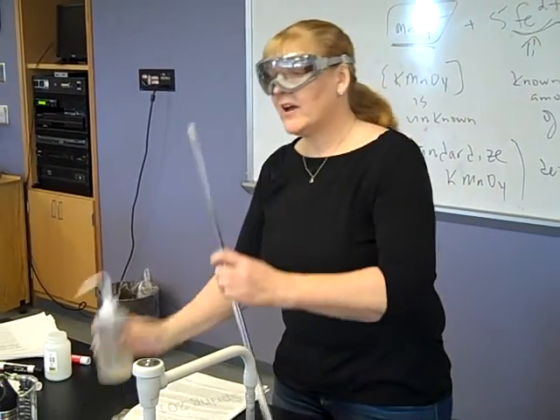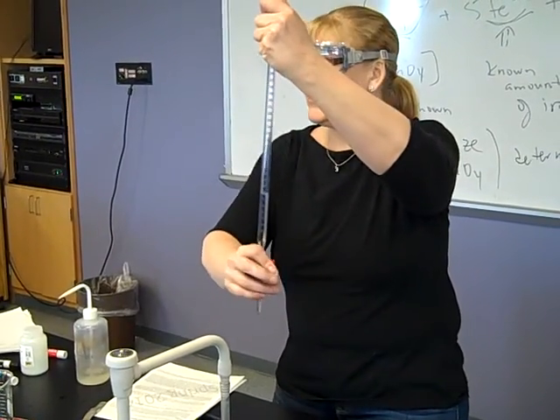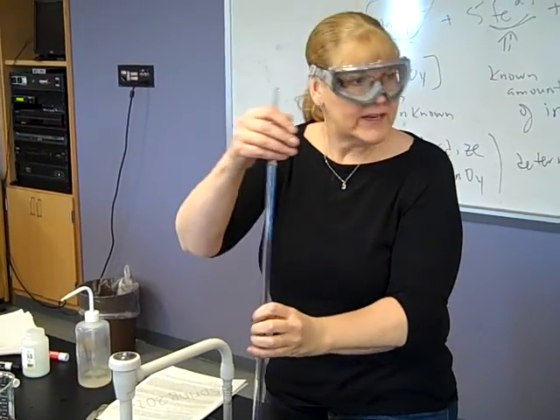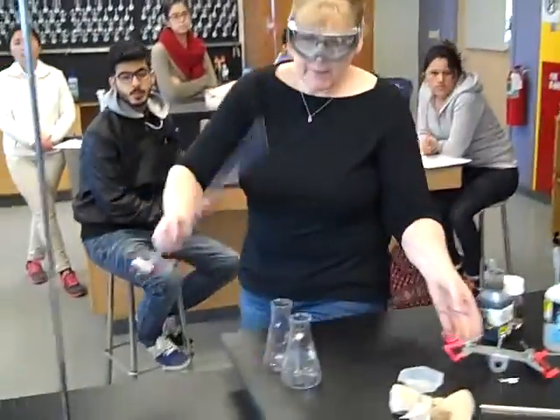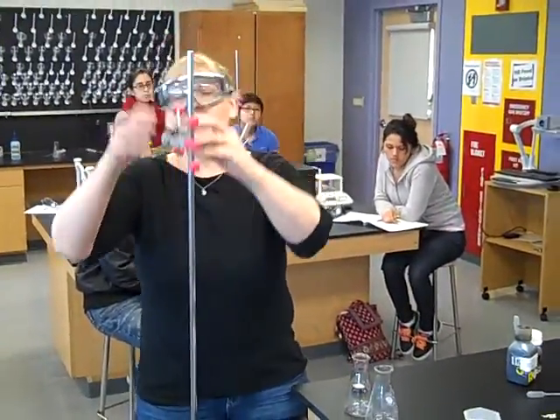This is a stopcock. If it is too tight, get it to someone teaching your class and get it fixed. So mine's working, and now I need to make sure that when I do my experiment, I'm not going to dilute my permanganate with the water that's in here. So I'm going to get a burette clamp.